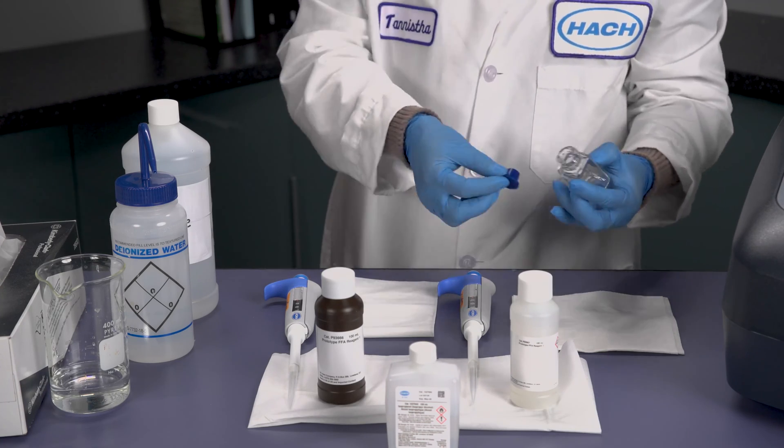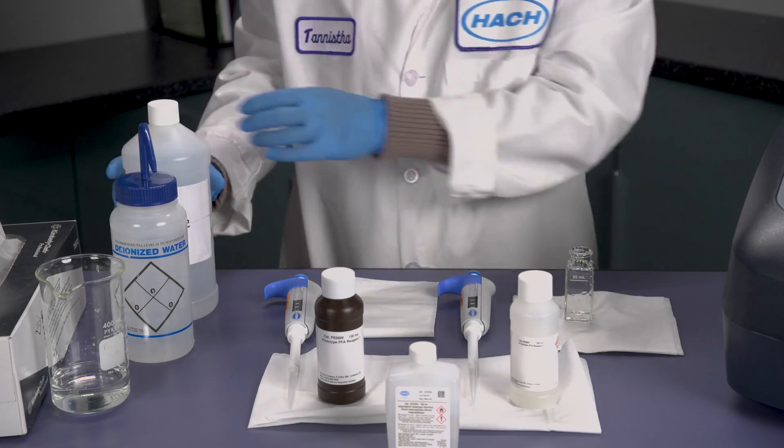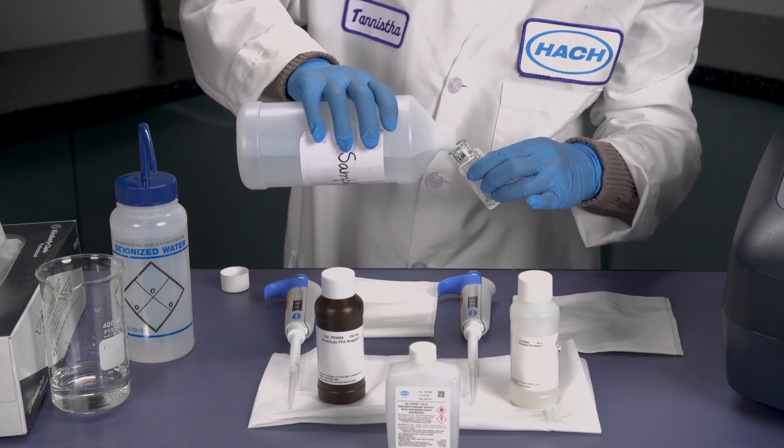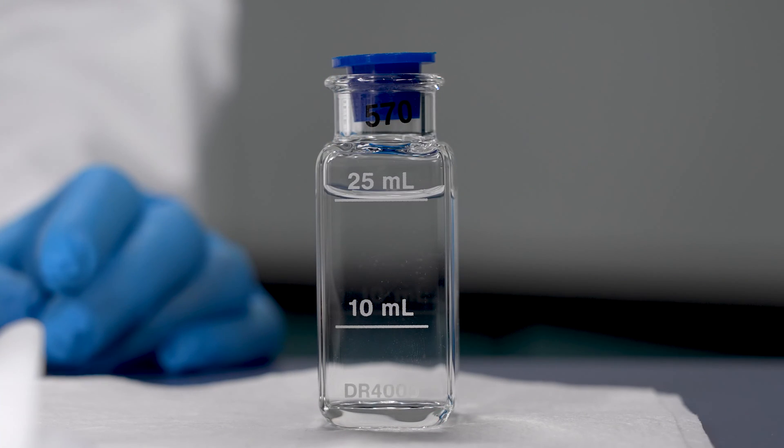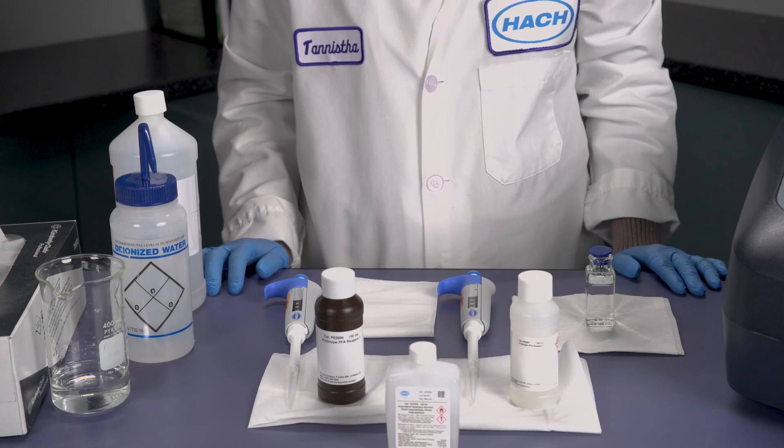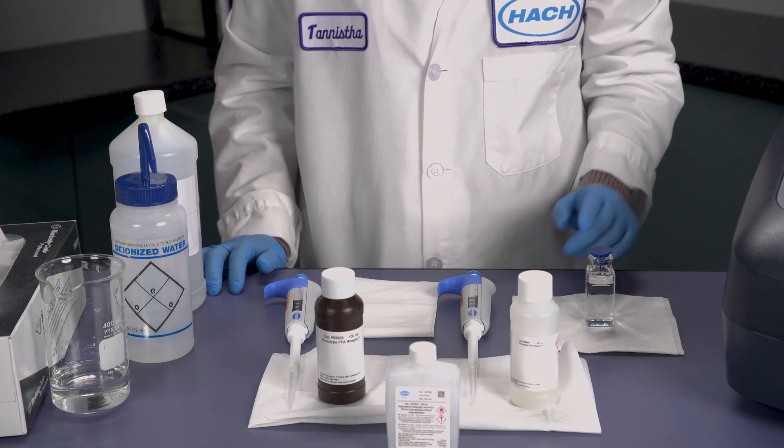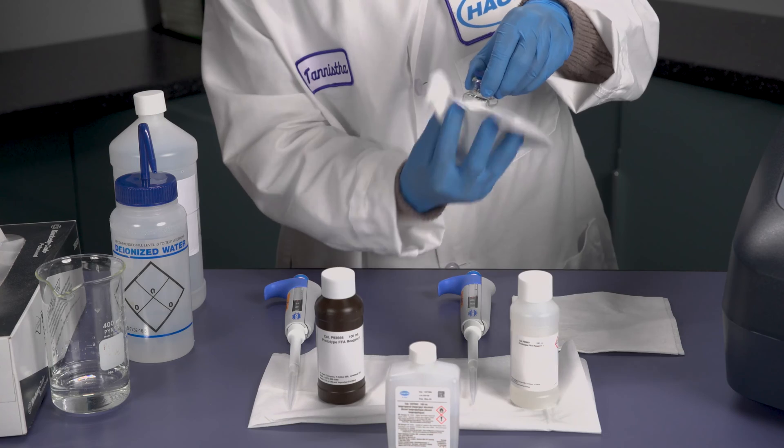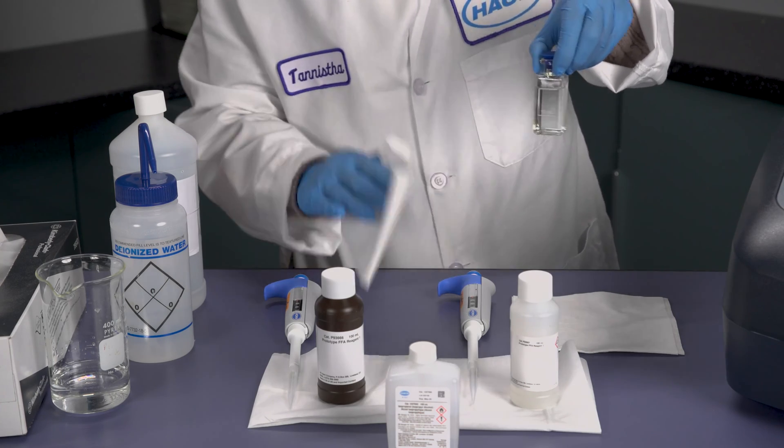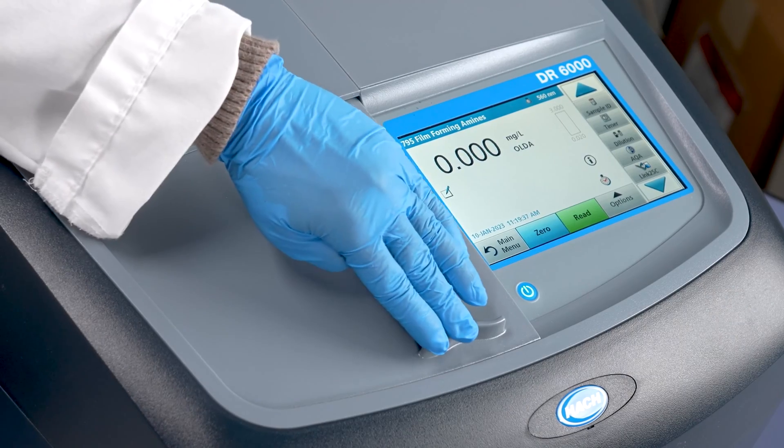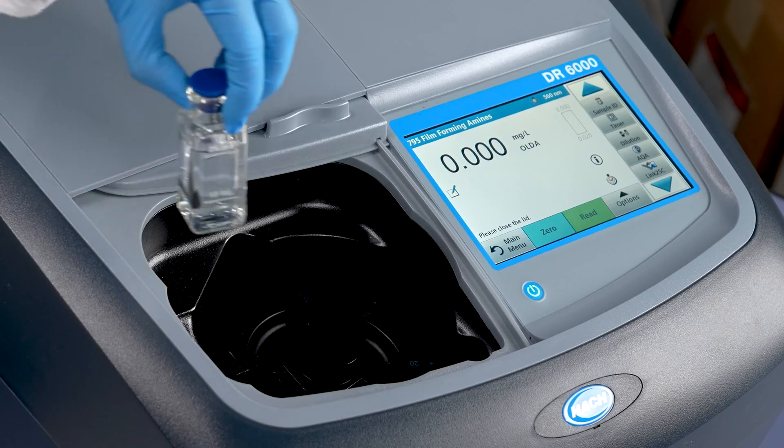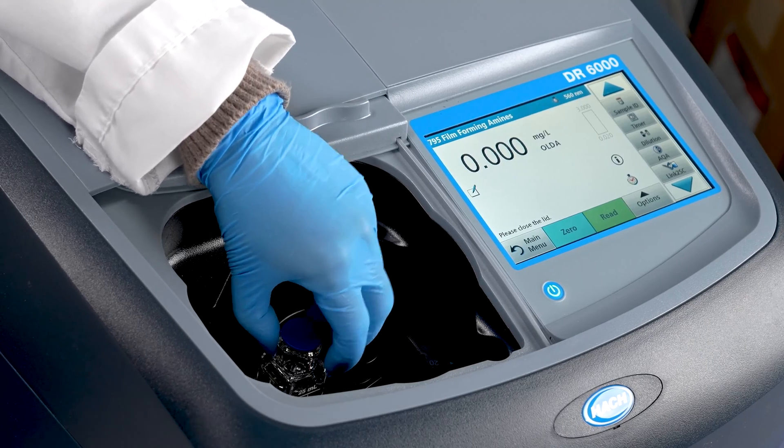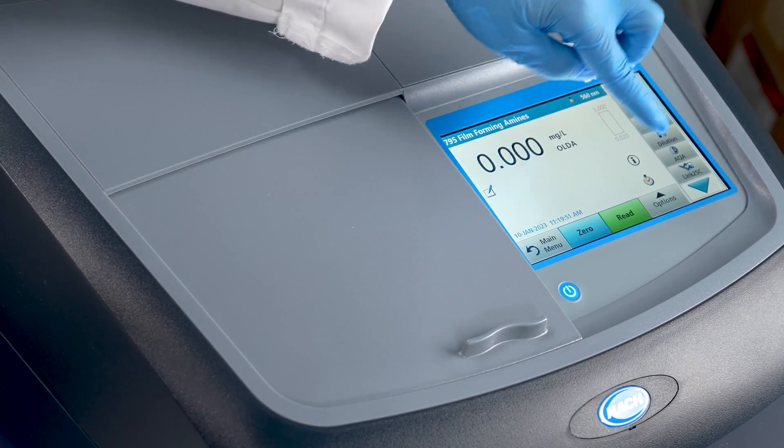Now we're ready to fill the sample cell with the sample. It's important to add the sample to the 25 ml mark as accurately as possible. At this point, the first thing we need to do is to zero the sample cell. Let's first make sure that you've cleaned the sample cell thoroughly with chem wipes to prevent any fingerprints or anything that may cause inaccurate readings. The sample cell should be placed in the spectrophotometer, if it's a DR6000, with the 25 ml mark facing you. On a DR3900, the 25 ml mark should be facing to the left. Now we'll zero the instrument.